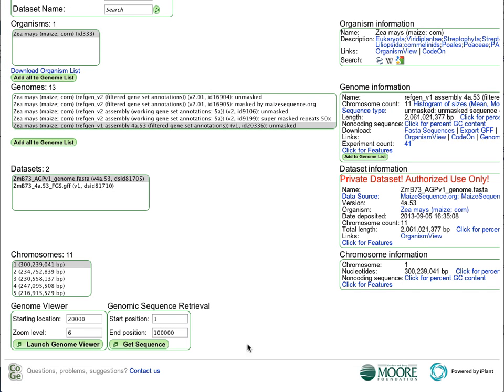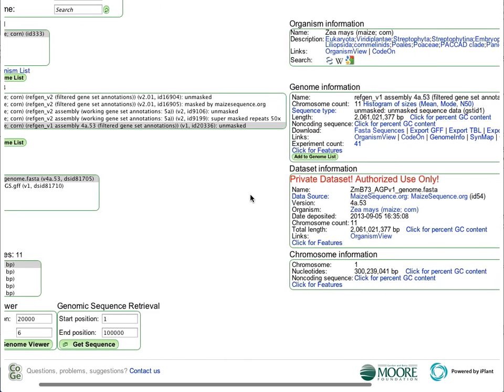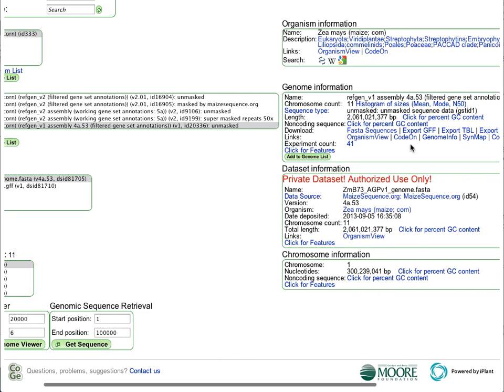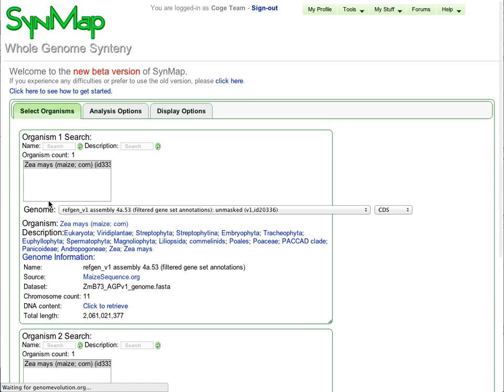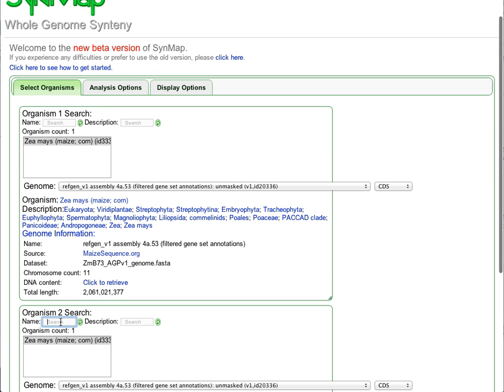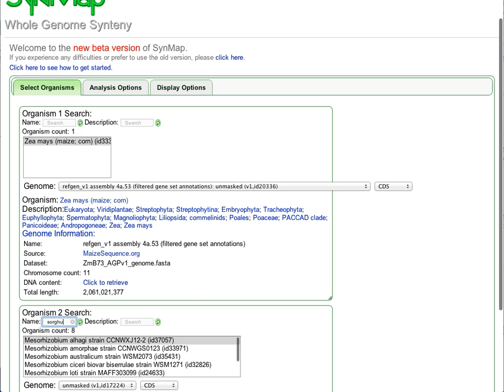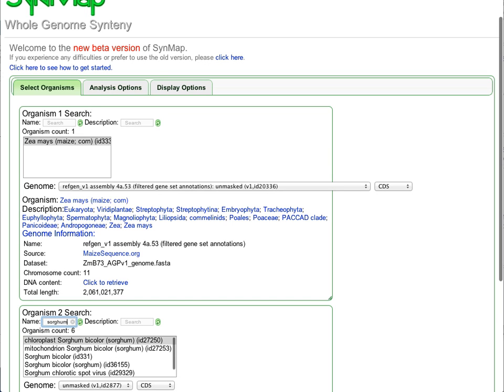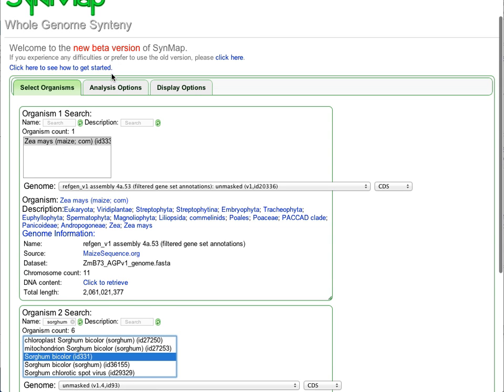To show some of CoGe's comparative genomic features, we're going to use a tool called SynMap, which allows us to compare two whole genomes in order to identify regions of synteny. We're going to compare the genome of Zea mays to that of sorghum.